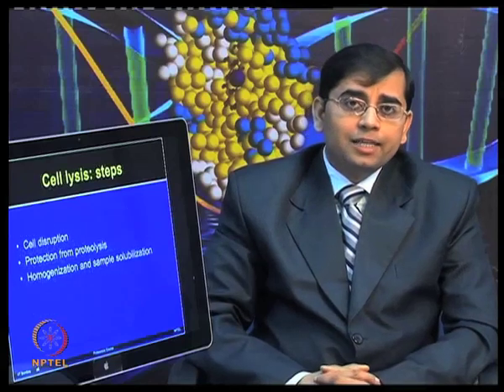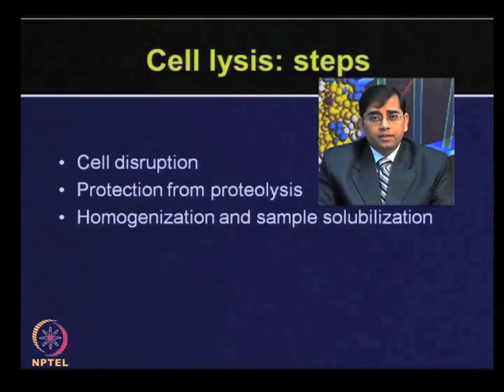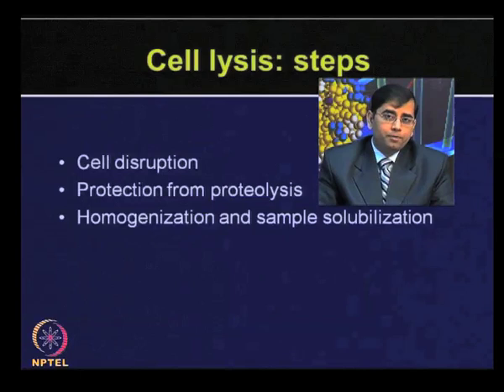The different steps are involved in cell lysis. You need to disrupt the cell, protect from proteolysis during the lysis step, homogenize and solubilize your sample.